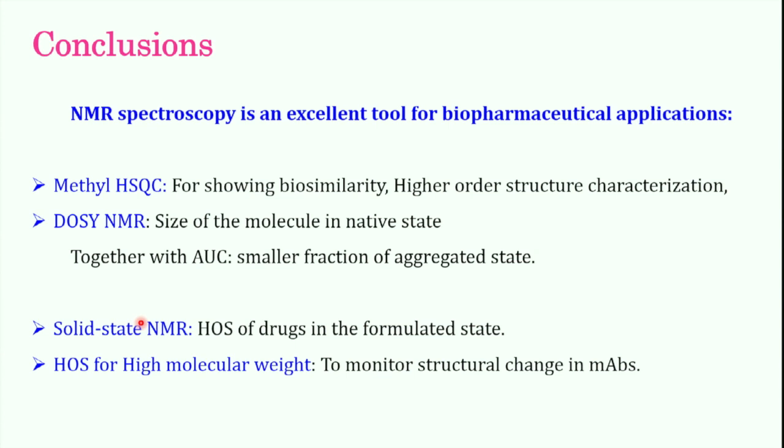We can investigate their aggregation state or degraded state, various aspects. So in summary, I can say that NMR spectroscopy is a fabulous tool for biopharmaceutical analysis.